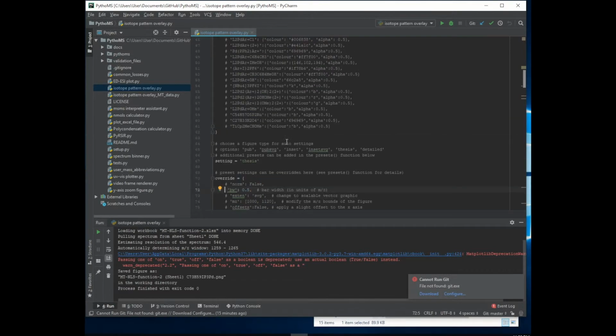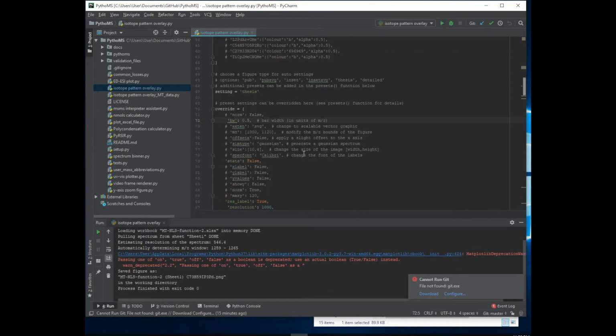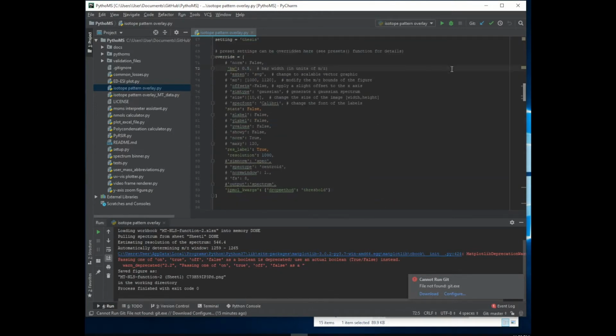Okay, and now we change another format, will be thesis, and we'll just let it run.